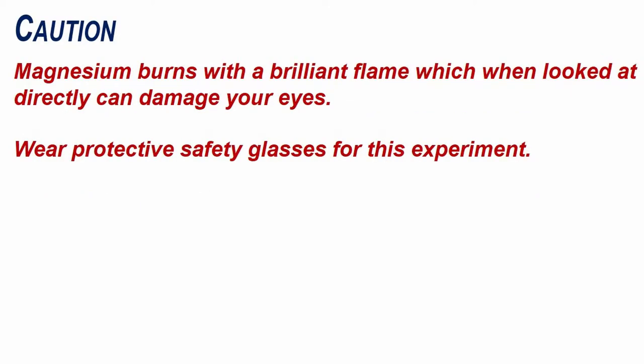Magnesium burns with a brilliant flame which when looked at directly can damage your eyes. Wear protective safety glasses for this experiment.